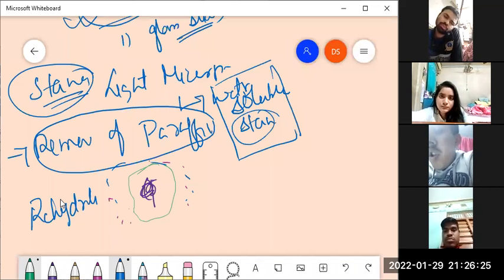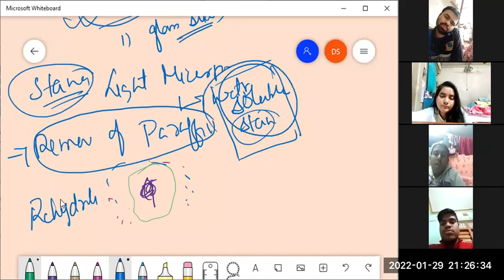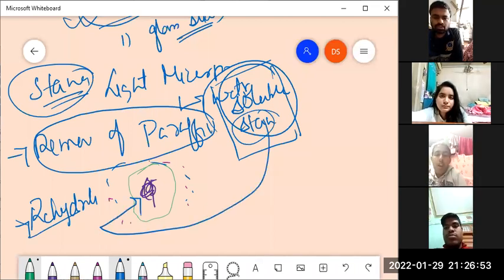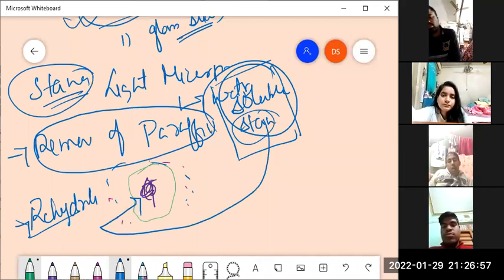Now, after dehydration, we have hardened the tissue. After that, we have sectioned it. After sectioning, when we now need this water-soluble stain to enter into the tissues, occasionally, this step of rehydration becomes a necessity. Once it is to an extent rehydrated, it's now easier for the stain to enter into the tissue. Did you understand? Yes, sir.